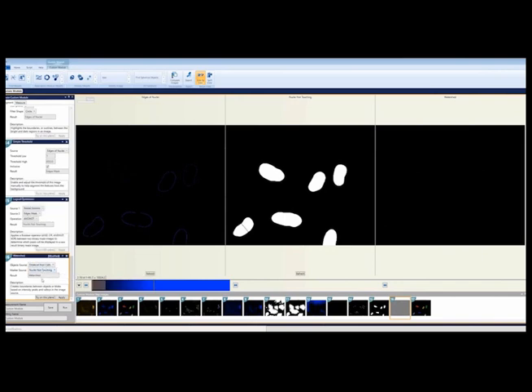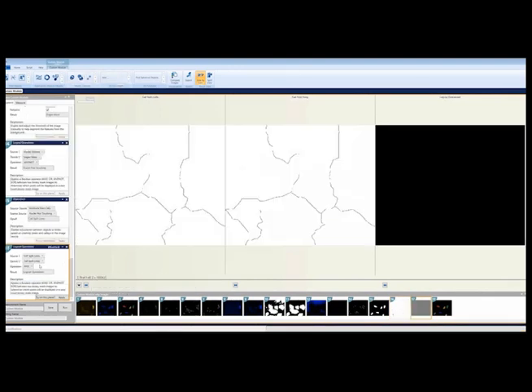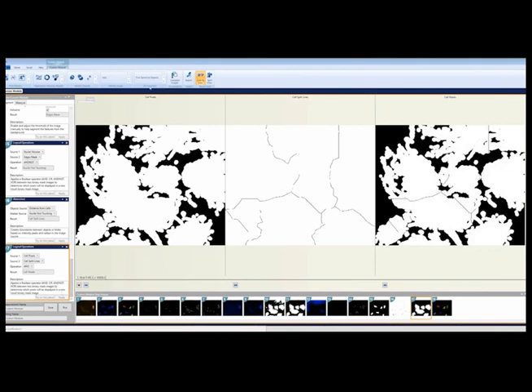With the nuclei markers in place, we have what we need for watershed lines. Watershed lines will trace lines along peak intensities and will be sure to draw a line between every pair of neighboring marker objects. We combine that result with cell pixels and we have our 2D cell mask.